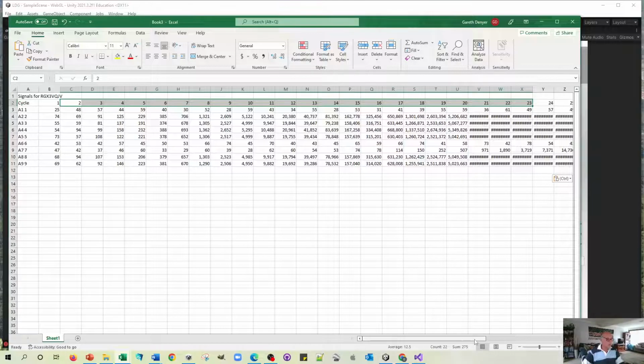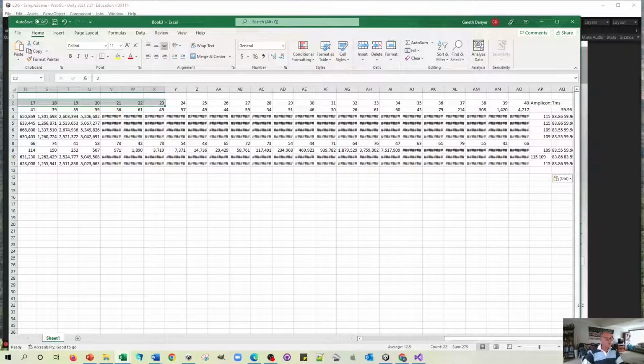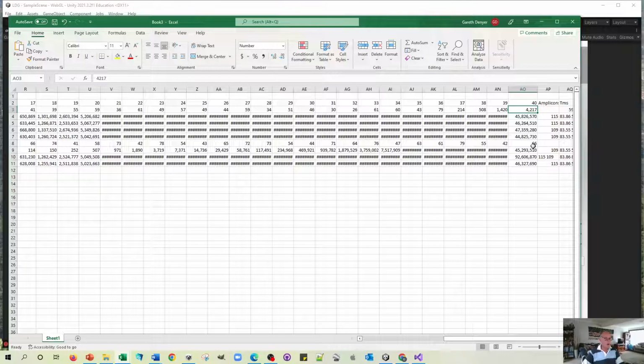but some of the real interesting information is right at the end. What is the final amount of amplicon? So millions of amplicons in these samples, not so much in tubes 1 and 6, and demonstrable lengths of amplicon in these.